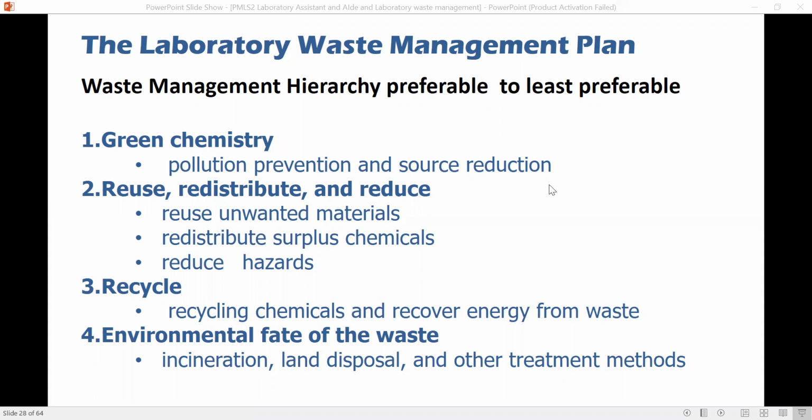Biodegradable, para walang itatapon. Tama? So, prevention. Pag sinabi nating prevention, it focuses on eliminating the amount of waste created from the source. Sabi ko nga, use biodegradable materials. So i-prevent daw. Okay, prevention.